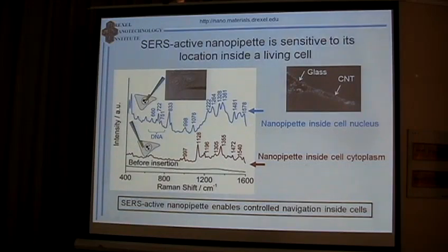Also, a similar principle is used for the technique called tip-enhanced Raman spectroscopy. People put a gold or silver particle on the tip of a small needle, for example an atomic force microscope tip or optical fiber, and bring it to the surface of the object they want to analyze. Then, within, say, a 40 to 50 nanometer area, there is an enhancement of signal.